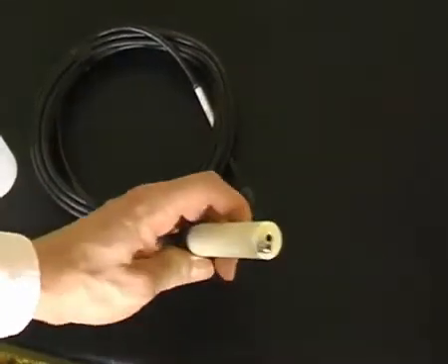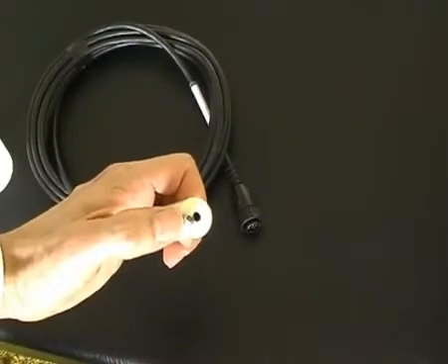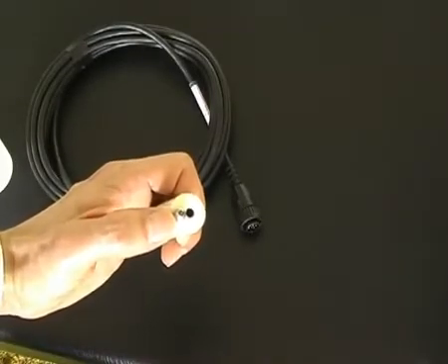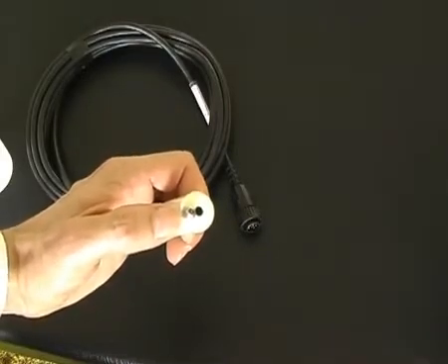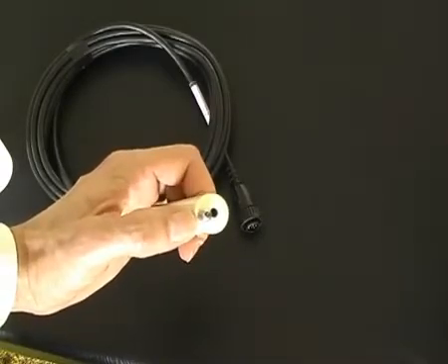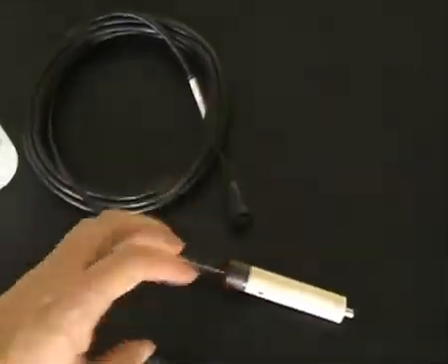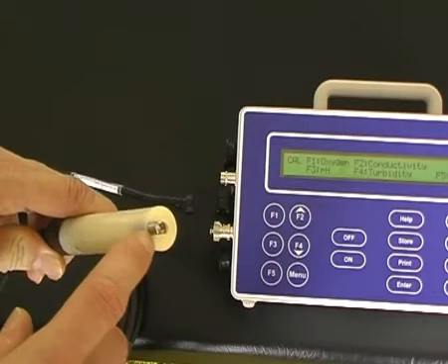Note that the conductivity sensor has an in-built temperature sensor, that stainless steel rod. It is not only temperature, it is also ATC, Automatic Temperature Correction, which corrects conductivity readings to 25 degrees Celsius. It must also be used for temperature correction of pH measurements as well. It is factory calibrated and only needs to be checked periodically, perhaps once a year.